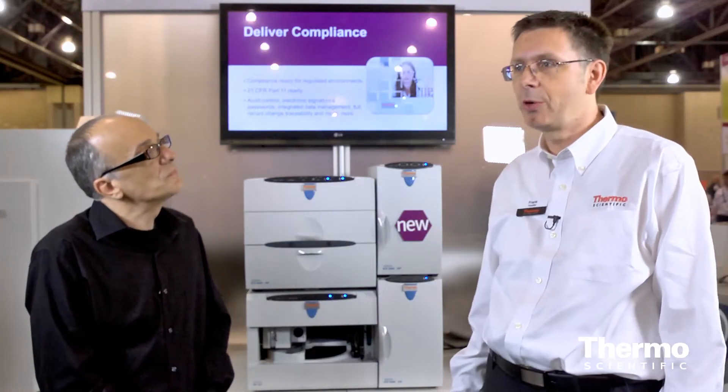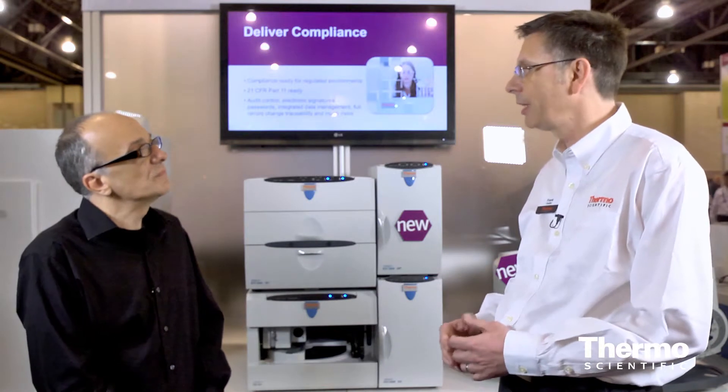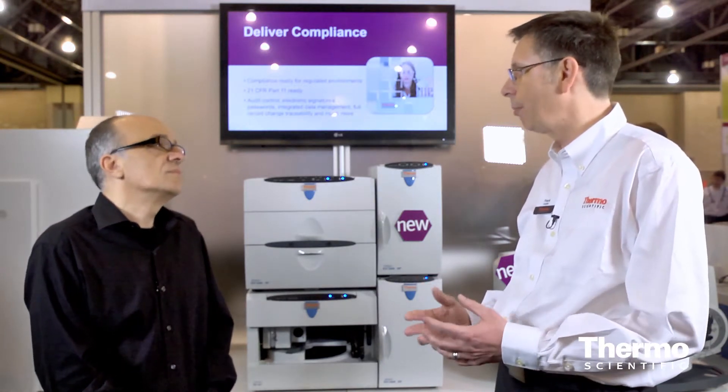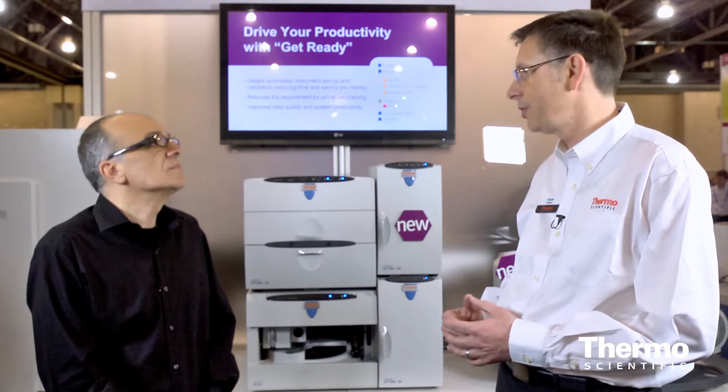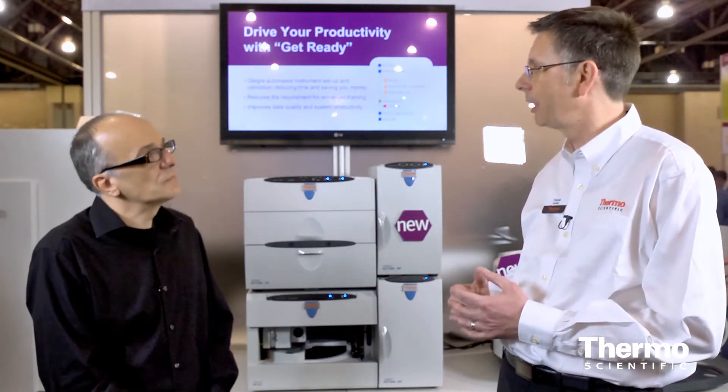The ICS-5000 Plus is the most versatile ion chromatography system we have on the market. It allows us to support all applications and chemistries, like two-dimensional IC separations with a standard-bore column in the first dimension and a capillary column in the second dimension. It also allows us to interface to other Thermo Scientific products like ICP-MS or MS/MS systems.